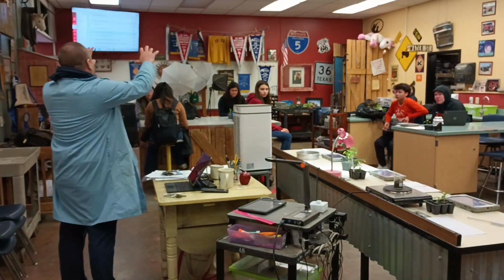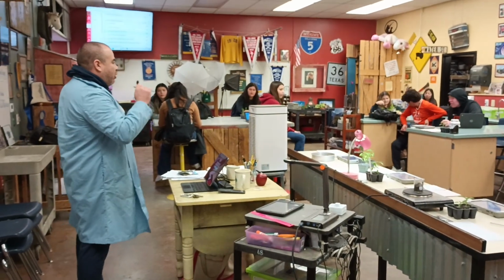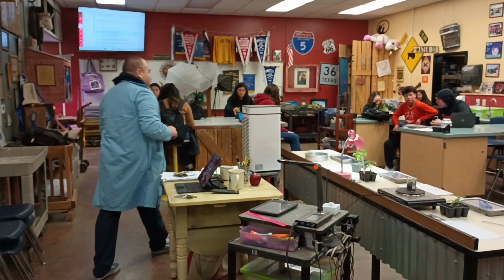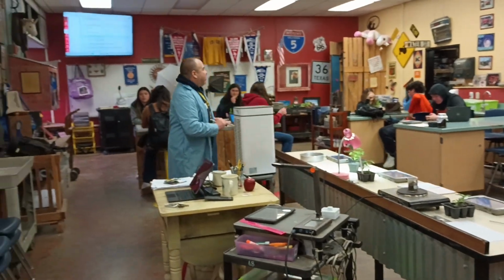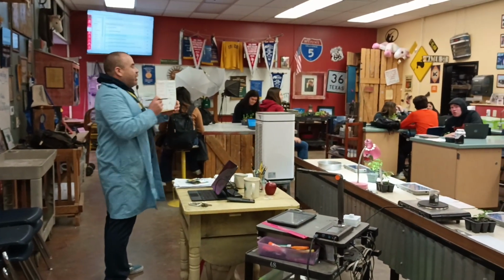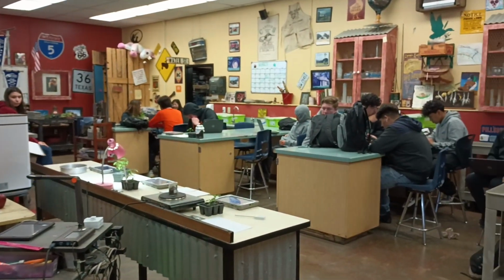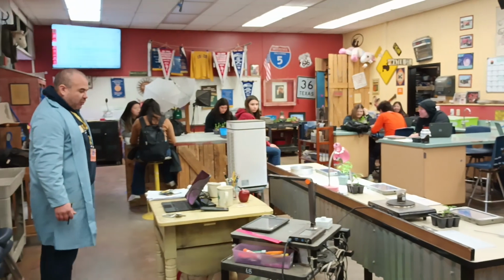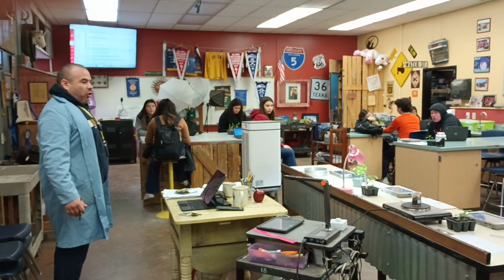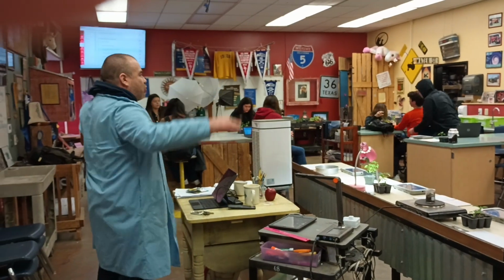Okay, so start with the plants in your table. Then work in a clockwise formation once you complete those samples that you collected data from. You have the worksheet on the modules. This is a continuation of soil sample 1. This is soil sample 2. Each table has your guided notes with some information on the soil samples and the agenda. So that's what we're doing today. Any questions? Okay, get started, please, everybody. For those who need any help, just raise your hand or let me know. So go ahead and get started at your table.